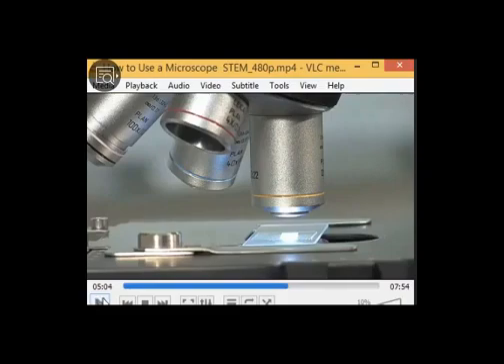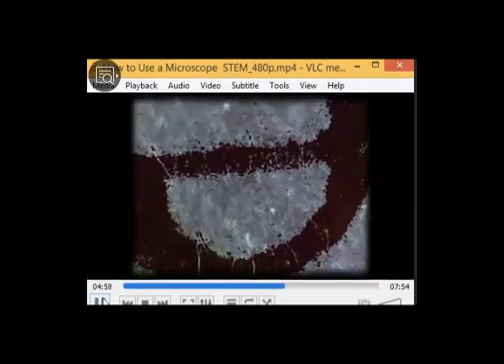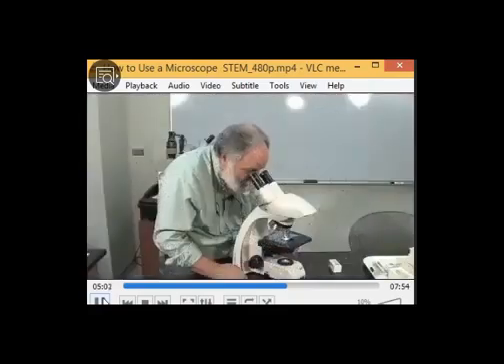What do you see in the microscope? This is the object you see in the microscope. So what is the difference between the last picture and this picture? In the last picture, you saw the letter E complete. But when you increase the magnification power, because of the zoom, you can see only a part of the picture, not the whole picture. This is called field of view. So it means that magnification power and field of view are inversely proportional. When you increase magnification power, field of view decreases.